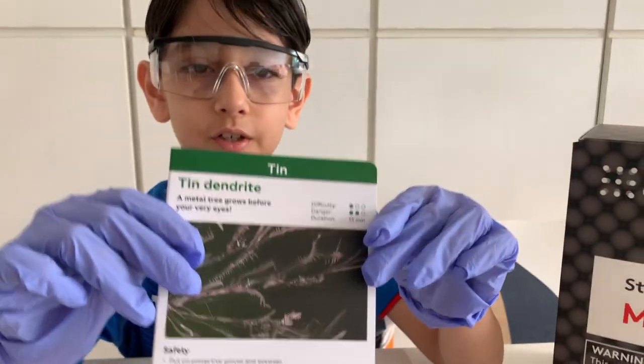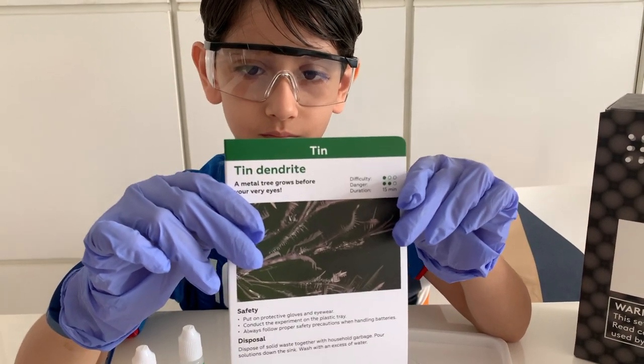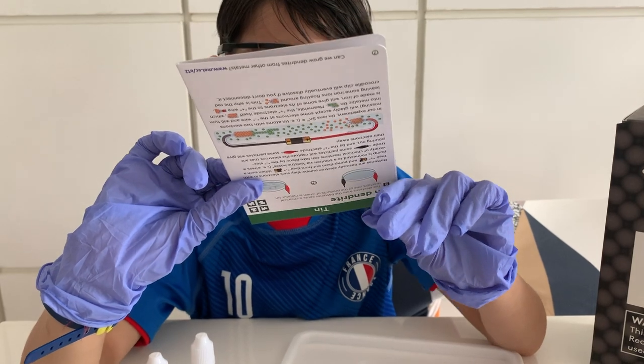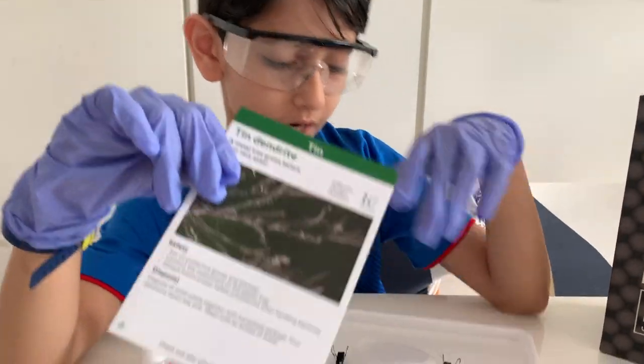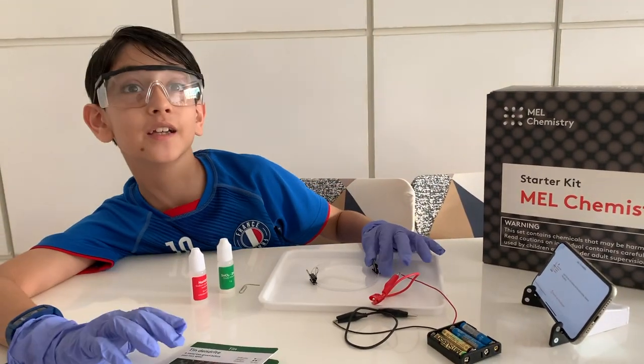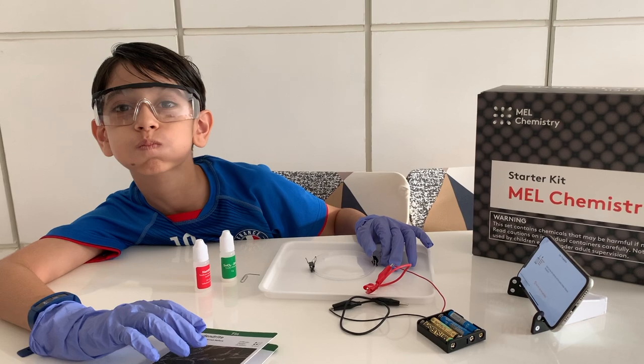So champ, what are we going to do today? Tin dendrite. What does that mean? We are going to see a metal tree grow. Isn't that exciting?